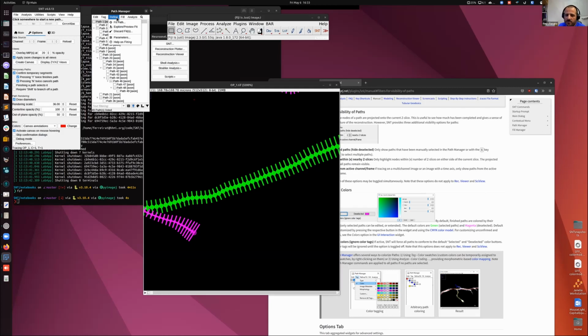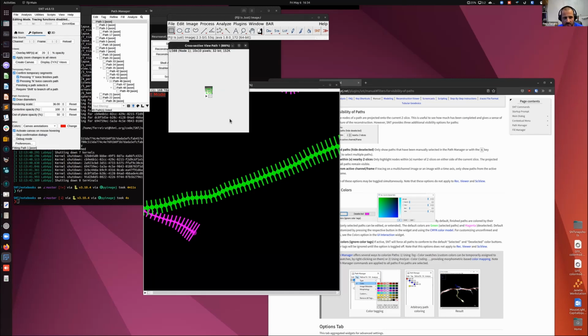And so these are going to refine the position of the node in case there was some artifact, in case you were clicking too sparsely, or in case you decided to do manual segmentation, which is also an option where you just place nodes without any assistance. Then this can bring the signal back to what would be the most accurate location of the centroid in terms of cross section. So we can do this. I'm going to choose this option. That is like a debug option that's going to explore, and then we see that's what it's doing here. It's very, very small.